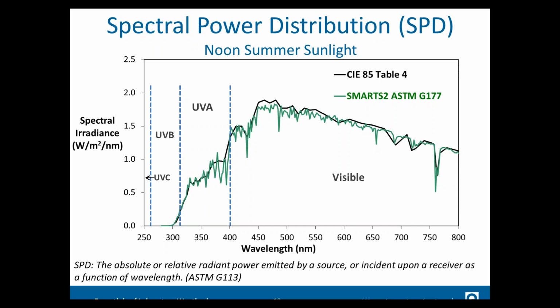material will see outdoors. When we talk about accelerated testing, we don't necessarily want to subject things to unrealistic conditions. We just want to subject them to realistic conditions and the maximum of that for longer periods of time than they would see outdoors. So outdoors, you'll only see noon summer sunlight probably a total of maybe 3-4 hours over the course of a year, whereas in a lot of weathering tests, we're going to try and simulate this continuously.